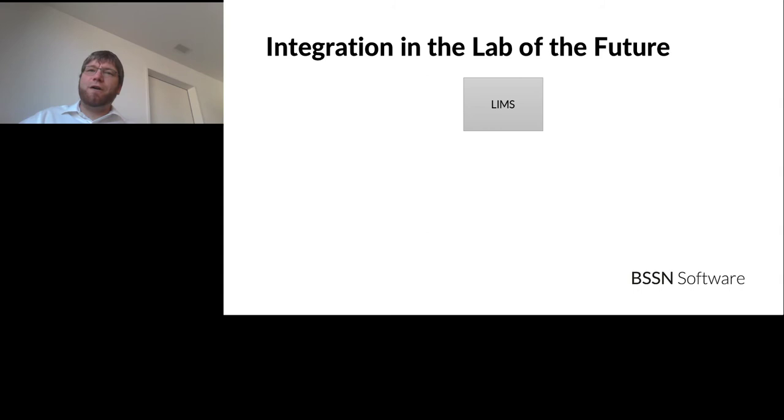We've talked earlier about how we would use a proprietary approach to connect a LIMS to a balance and so on. Let's try to do the same again, but let's make it a bit more complicated, but this time use standards to solve the problem much more elegantly. And in this case, we'll be using SiLA and AnIML. So at the top here, I've got my LIMS system, and the LIMS system is supposed to interact with the instruments in the lab because I've got some samples set up.